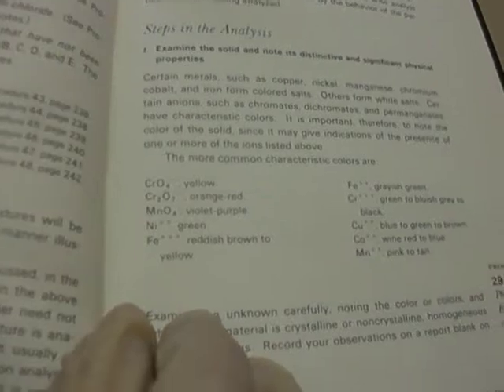If you look at the first steps for dissolving a sample, it says to look for the color of the solid, and it gives a list of different common colors.